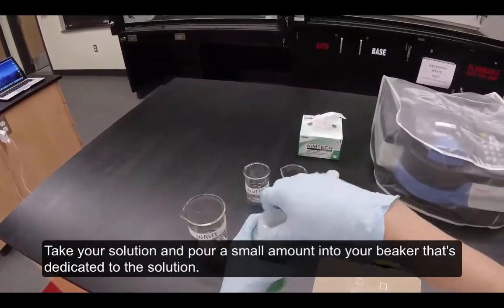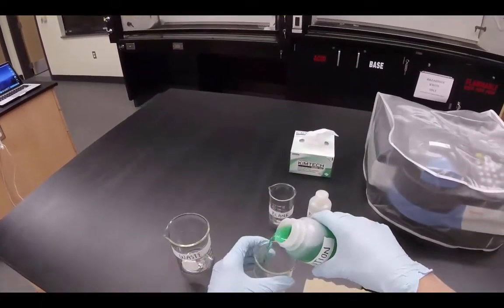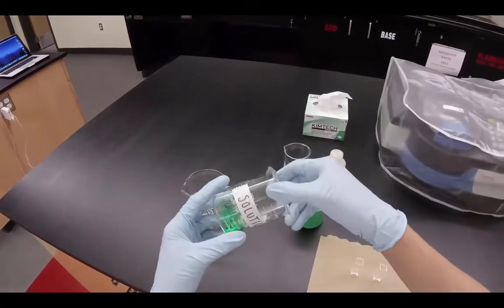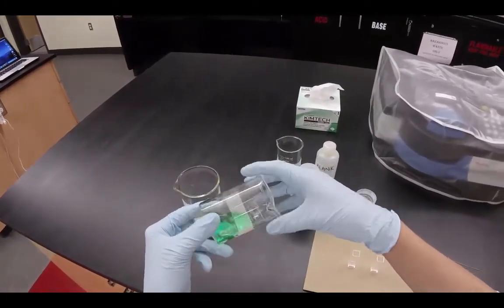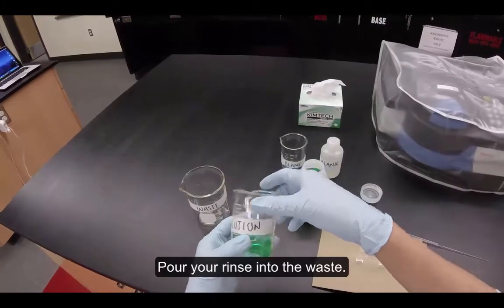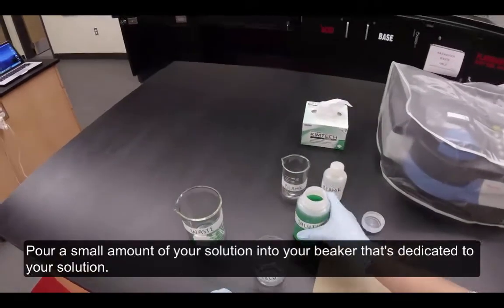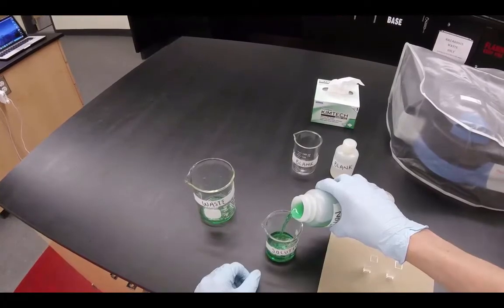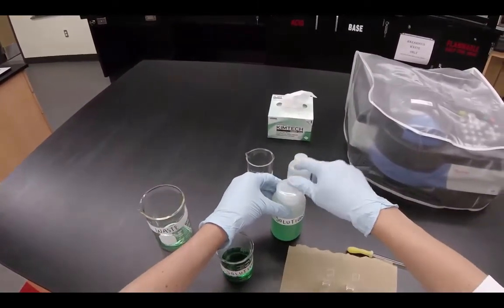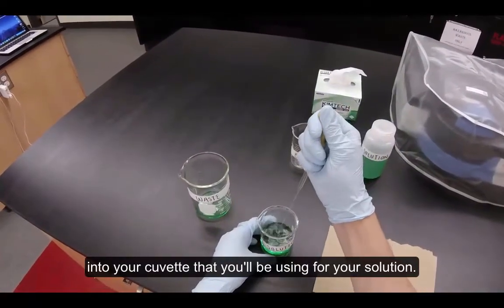Take your solution and pour a small amount into your beaker dedicated to the solution. Rinse your beaker with solution to coat the walls of the beaker. Pour your rinse into the waste. Pour a small amount of your solution into your beaker dedicated to your solution. Using a pipette, transfer the solution into your cuvette that you'll be using for your solution.